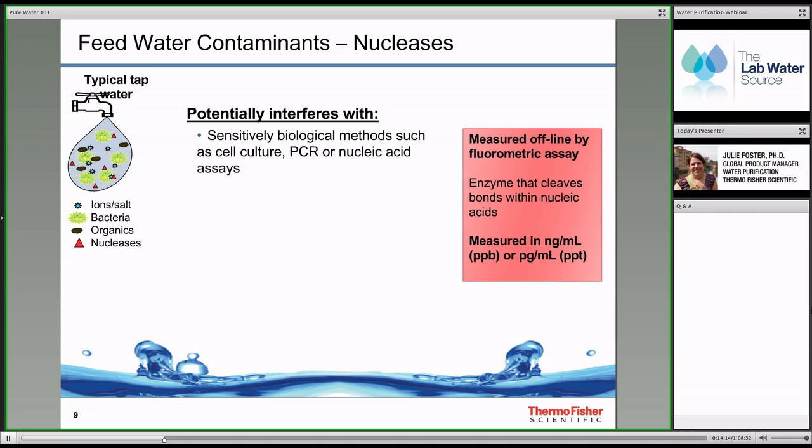So traditionally, scientists are using either DEPC, it's a chemical to inactivate RNase, or they're autoclaving water. This is actually the method we used in our lab back when I was a graduate student. So DEPC, it's an extra step that you have to do, and it adds cost to your experiment. And autoclaving, same thing. It's got the same drawback. It's an extra step, autoclaving your water.